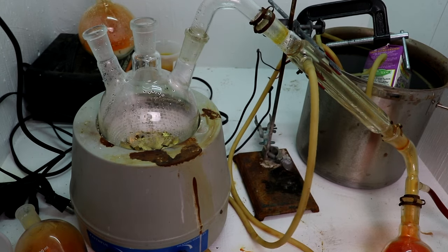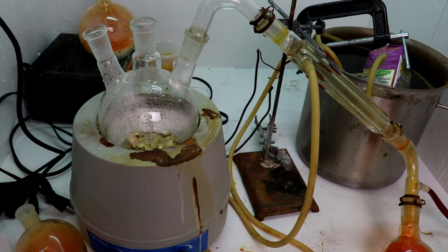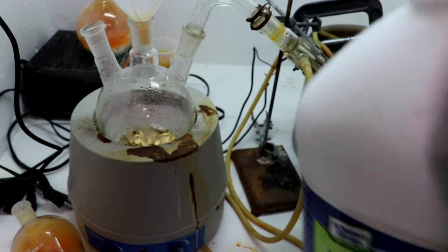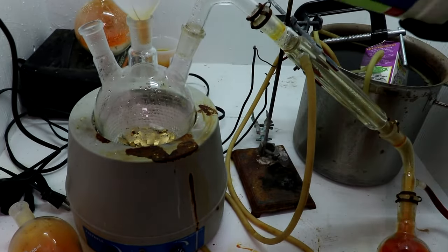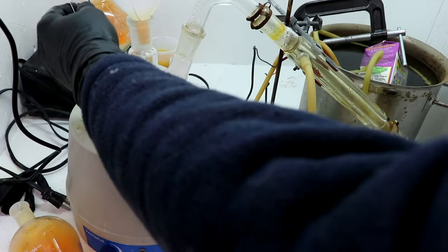I add a stir bar. Yeah, I guess it really wouldn't hurt. Now I'm going to add some muriatic acid, or hydrochloric. I'm just going to add enough to cover the gold, which should be in excess. And now for the bromine.